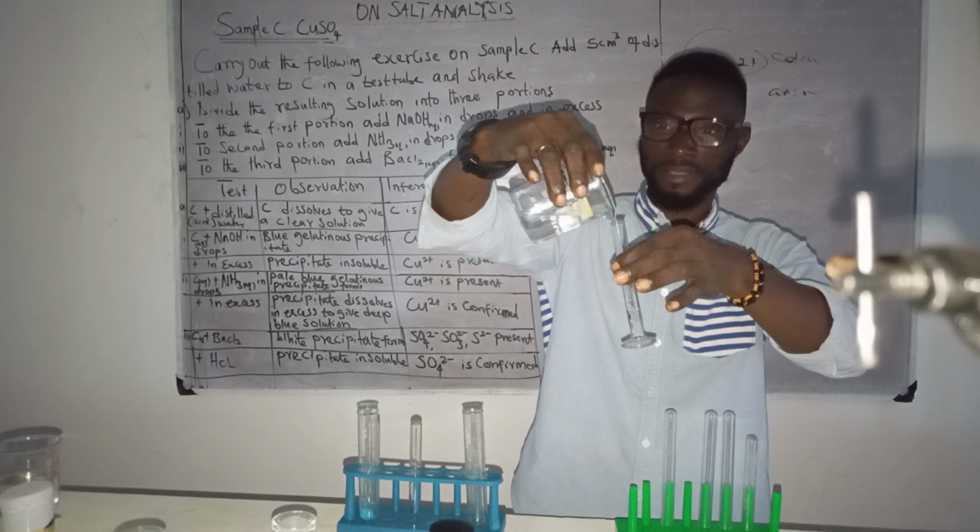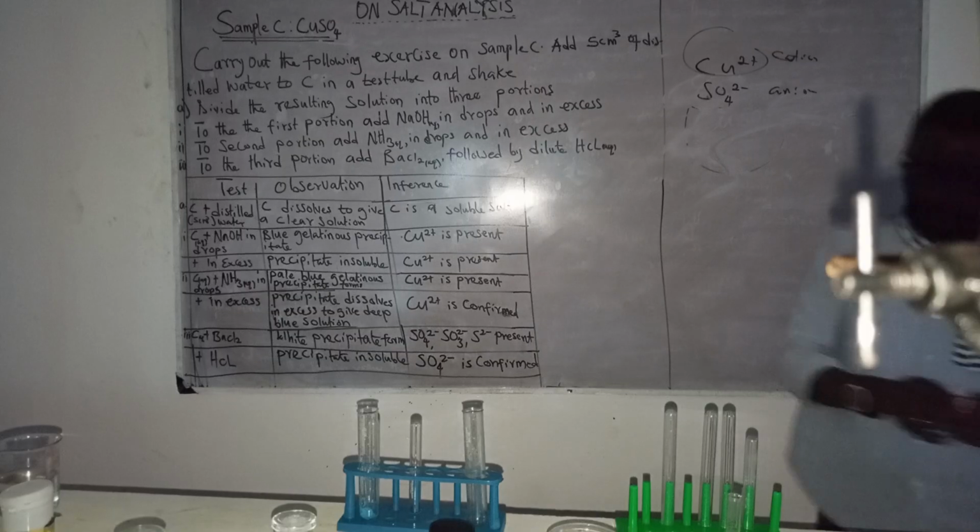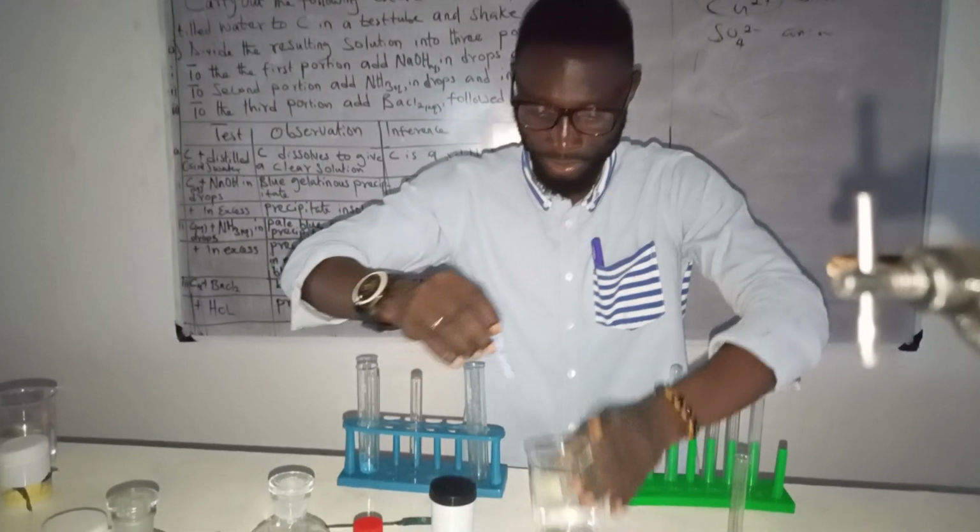Please let me confirm if this is actually distilled water with my litmus paper. Please permit me, because I've carried out some practical today, so that I will not do the wrong thing.